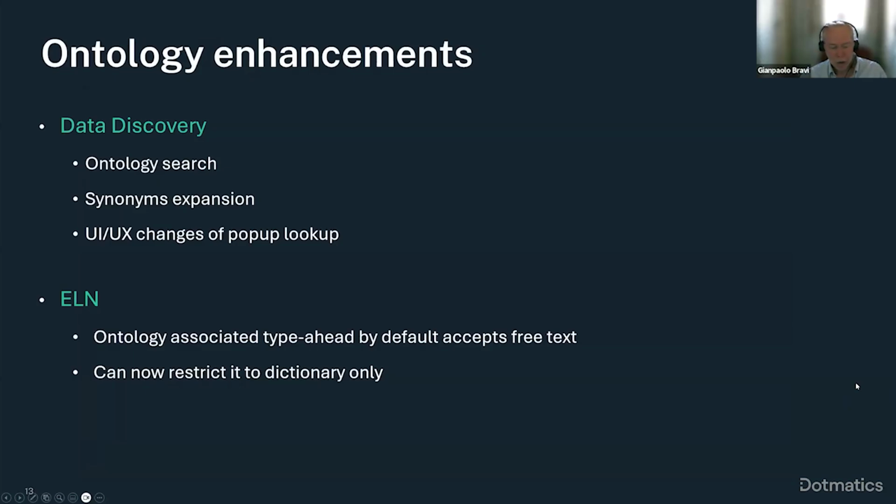Okay, let's now change topic and talk about ontology. In data discovery, we have implemented an ontology search capability with synonym expansion. In the ELN, we have enabled a strict mode when using a type ahead associated to an ontology.